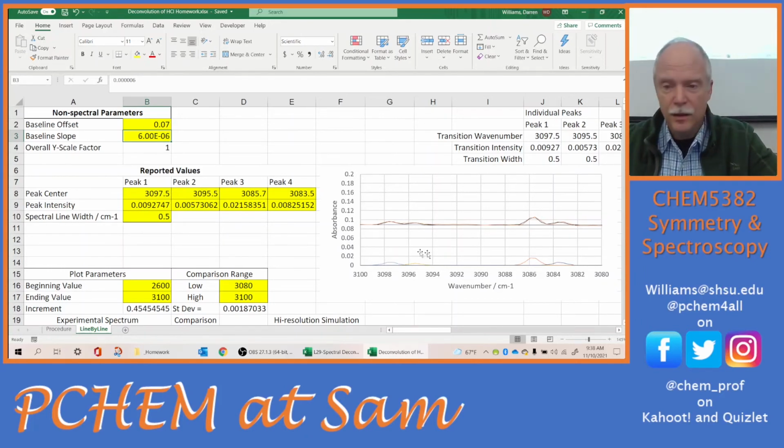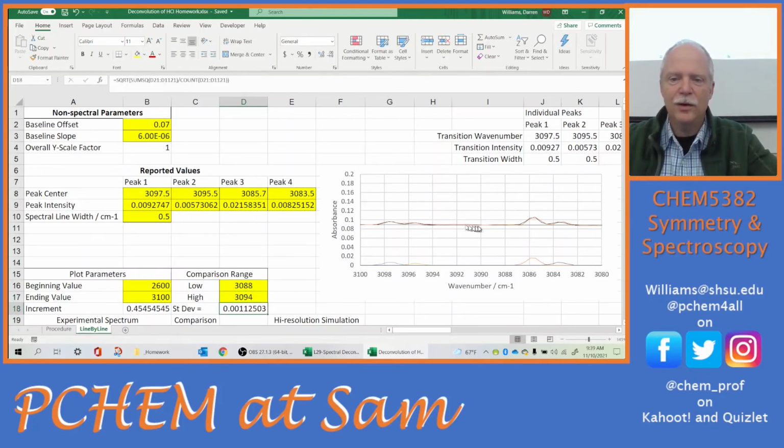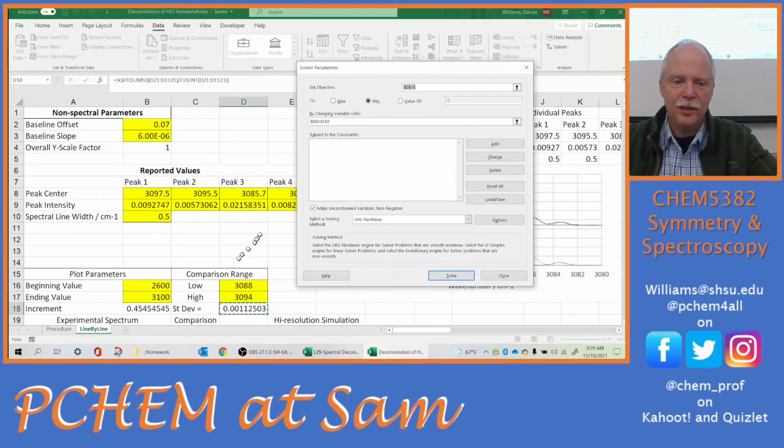You see that? So my baseline is on there, my peaks are on there, but I want to set my comparison range for the residuals just with this middle region. Okay, so I want to go, what do you say, 3094 down to 3088? So just go 3088, 3094. And so there's my standard deviation for this middle range. And I'm going to use that then to optimize my baseline. So let's go ahead and do a data solver. I'm going to set my objective, which is my standard deviation, to a minimum by changing the baseline cells. So I'm going to change those 2 cells and go.